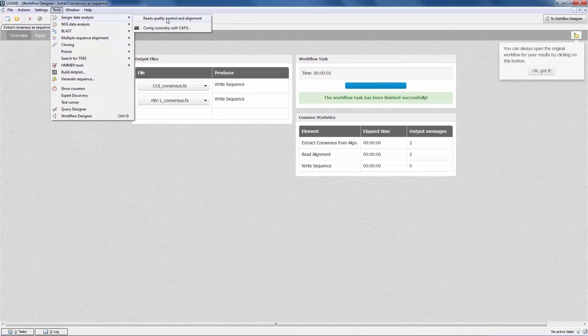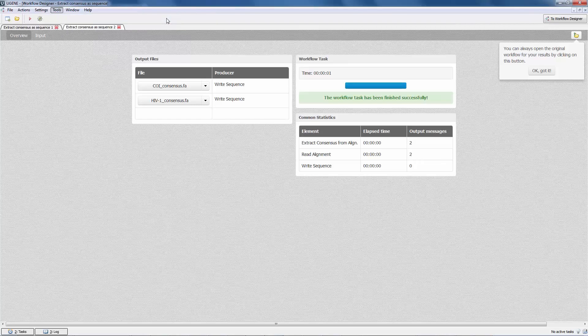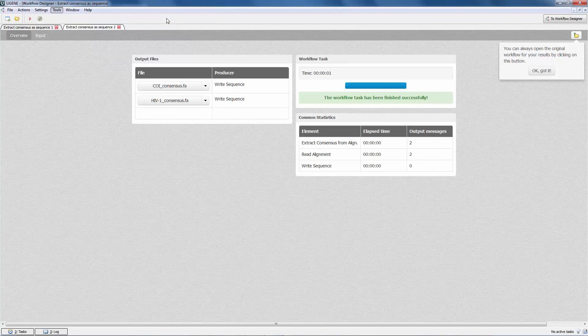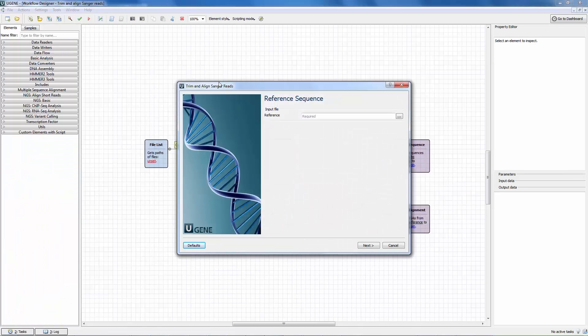For example, let's open a newly added workflow that automates the Sanger sequencing data analysis. Double click on the sample description to load the workflow. A wizard to configure the workflow appears automatically.